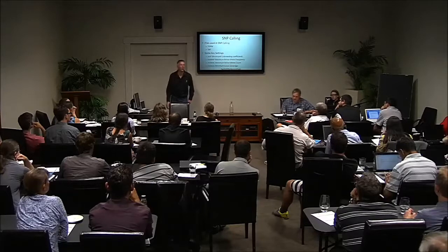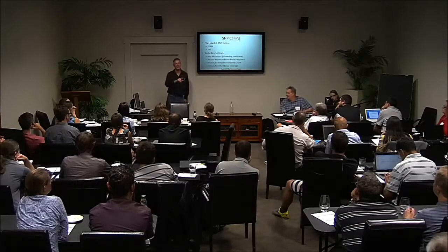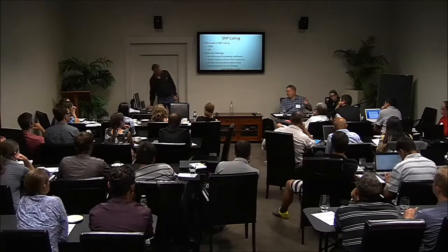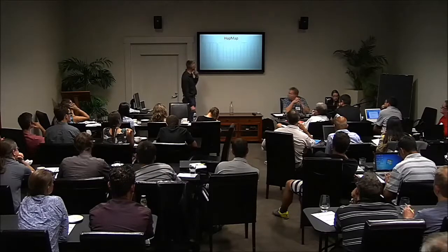There's a thing called a merge duplicate SNPs plugin that actually addresses that exact issue. So you can get the same SNP read twice from different strands, from different tag loci. That's exactly the point that John's making. Yeah, absolutely. And there's a plugin that deals with that.